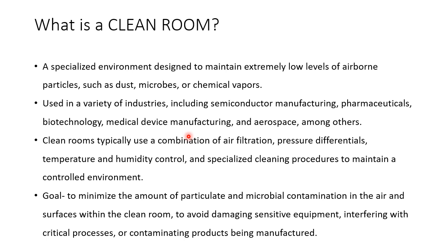Then cleaning procedures. Now it is a clean room, so you have to clean it properly each and every day. Not just cleaning, you also have to sterilize the specialized garments that we use while entering a clean room. So there are different types of cleaning, disinfection, or sterilization processes that are to be followed to maintain this controlled environment in a clean room.